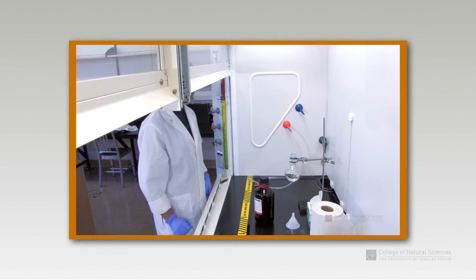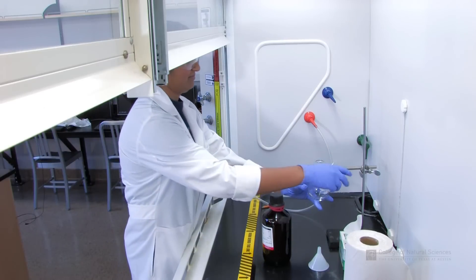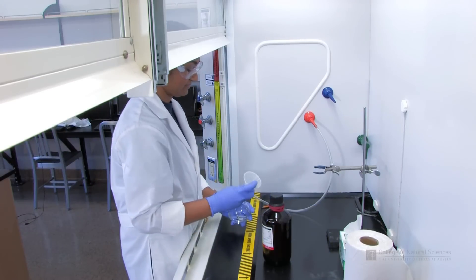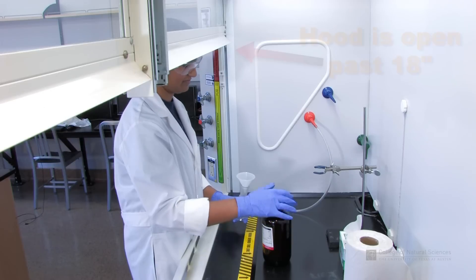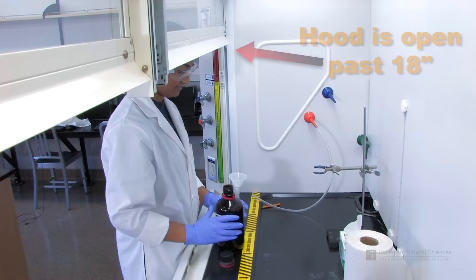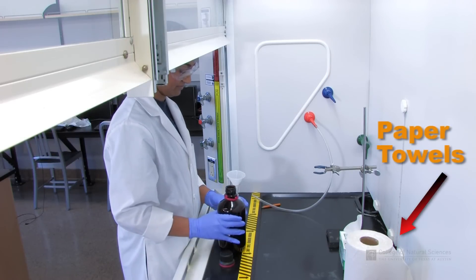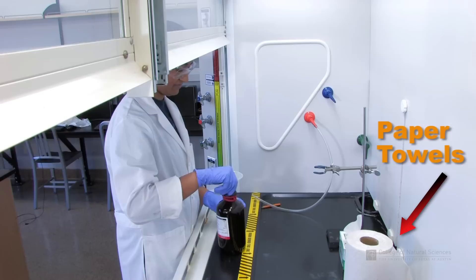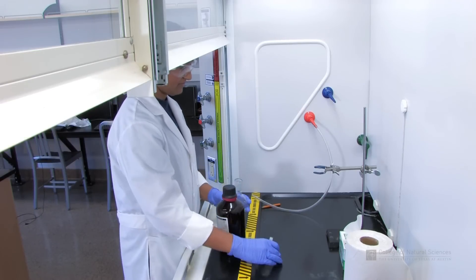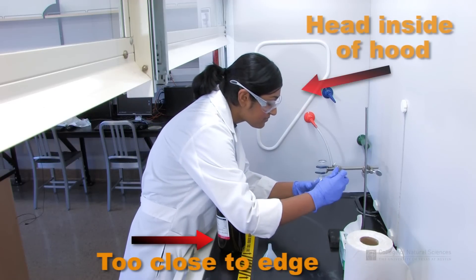Watch this short clip of a student working in the fume hood. Can you identify any unsafe practices in the video? First of all, you should notice that the hood sash is raised all the way up instead of keeping it within 18 inches. There are paper towels stored in the hood, which is a fire hazard and may decrease hood efficiency due to turbulence. The student is working too close to the edge of the hood and leans in to do her work.